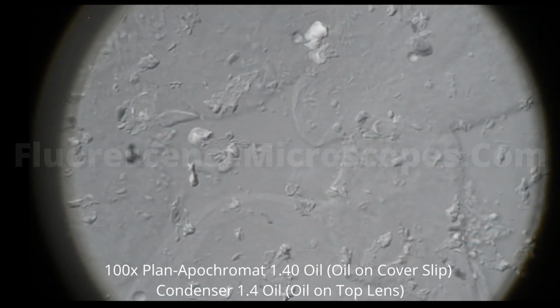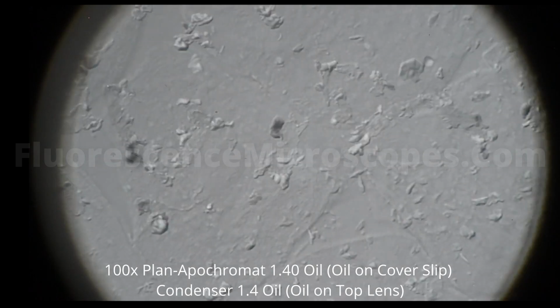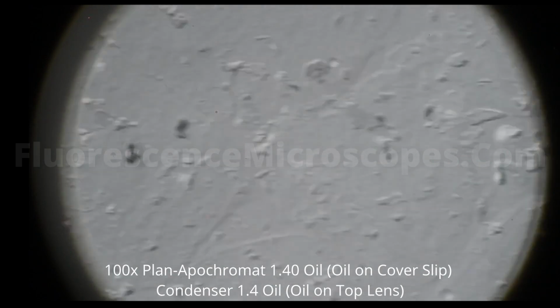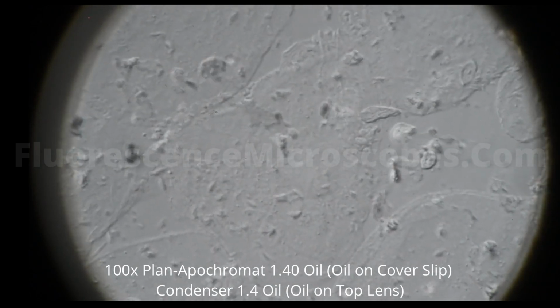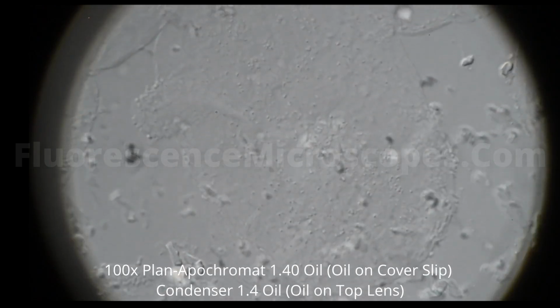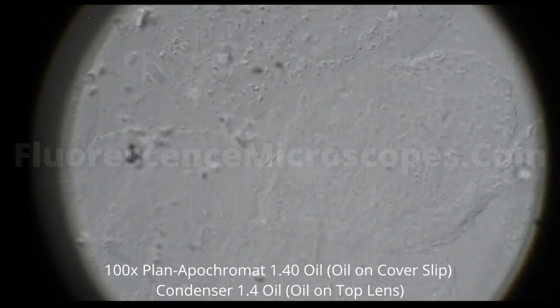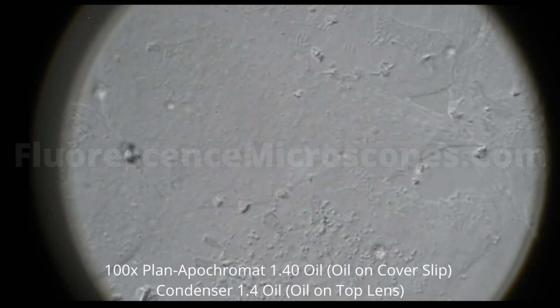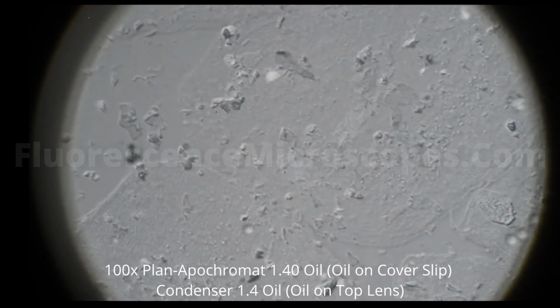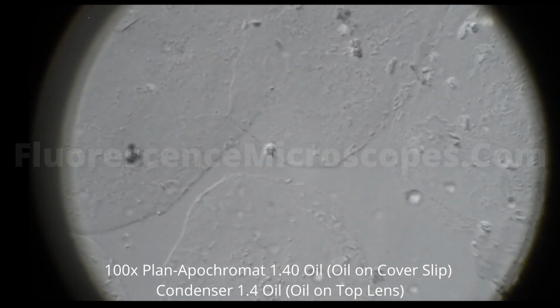We're using oil immersion for the top of the cover slip, and we're using oil immersion on the 1.4 numerical aperture condenser, so the top lens of the condenser has oil on it. These are all the cheek cells. There's quite a few on this slide.